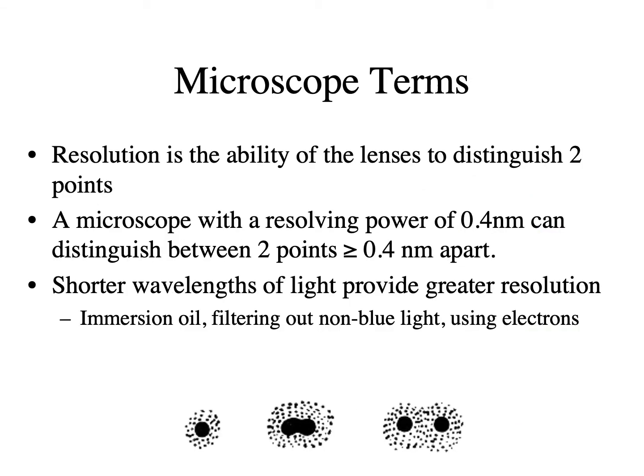Some important terms that I'll want you to practice with are relevant to microscopy. The first one is going to be resolution. Resolution is how clear an image looks under the microscope, and the better the microscope, the better the resolution.